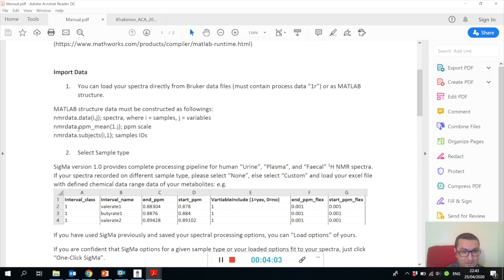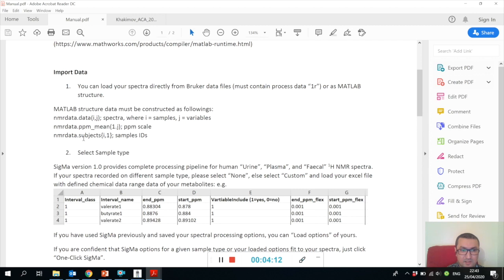You can see it has to be organized as data structures where you have NMR data.data - that's your real spectra - and the ppm scale and sample names.